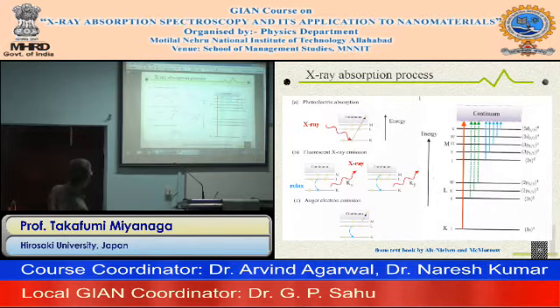In the case of fluorescence emission, once an electron is emitted from the K-shell, a vacancy exists in the K-shell. So relaxation occurs from the L or M, the upper electrons. The energy difference goes to another X-ray. This is called fluorescence. If the electron comes from the L level, we call it K alpha.